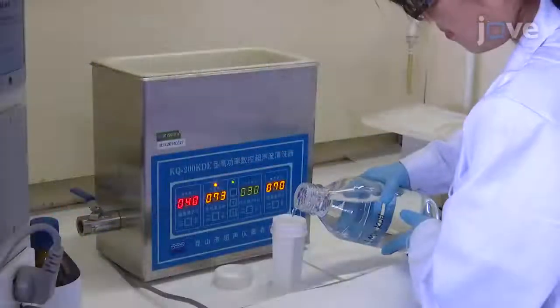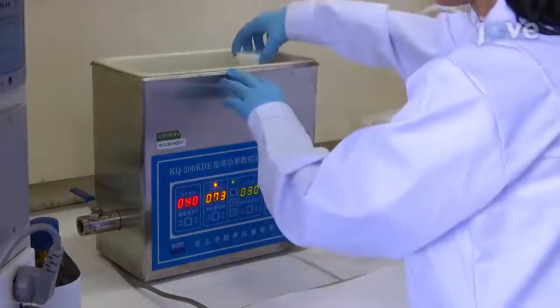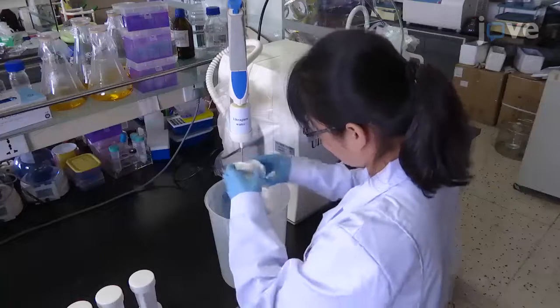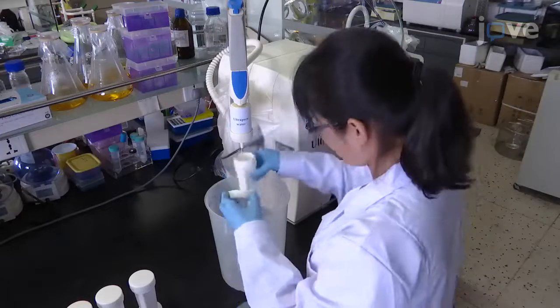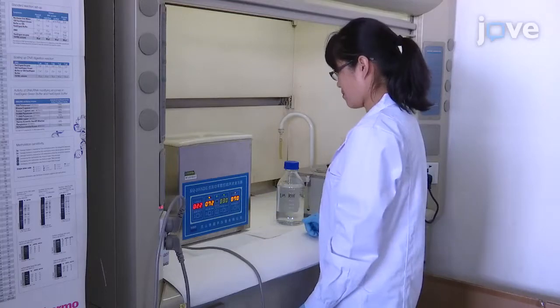Next, sonicate the coverslips with 1 molar potassium hydroxide for 30 minutes, and rinse the coverslips with ultra-pure water 3 times. Then repeat the ethanol and potassium hydroxide sonication once.